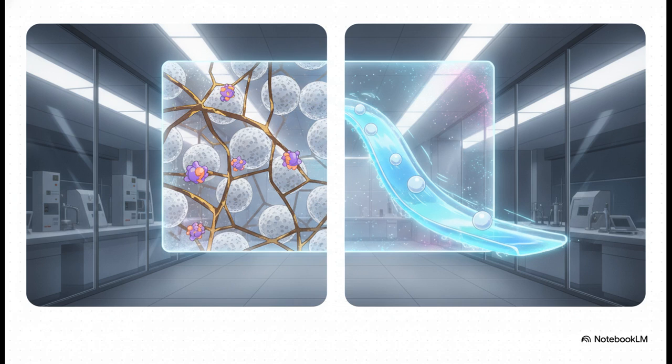On the other hand, you've got the mobile phase. This is a polar solvent, usually water mixed with something like methanol or acetonitrile, and it flows smoothly right through the column. So, the hydrophobic compounds interact strongly with those carbon chains and get stuck. They're retained longer. Meanwhile, the hydrophilic, or water-loving molecules, they rush right past on the polar mobile phase water slide.